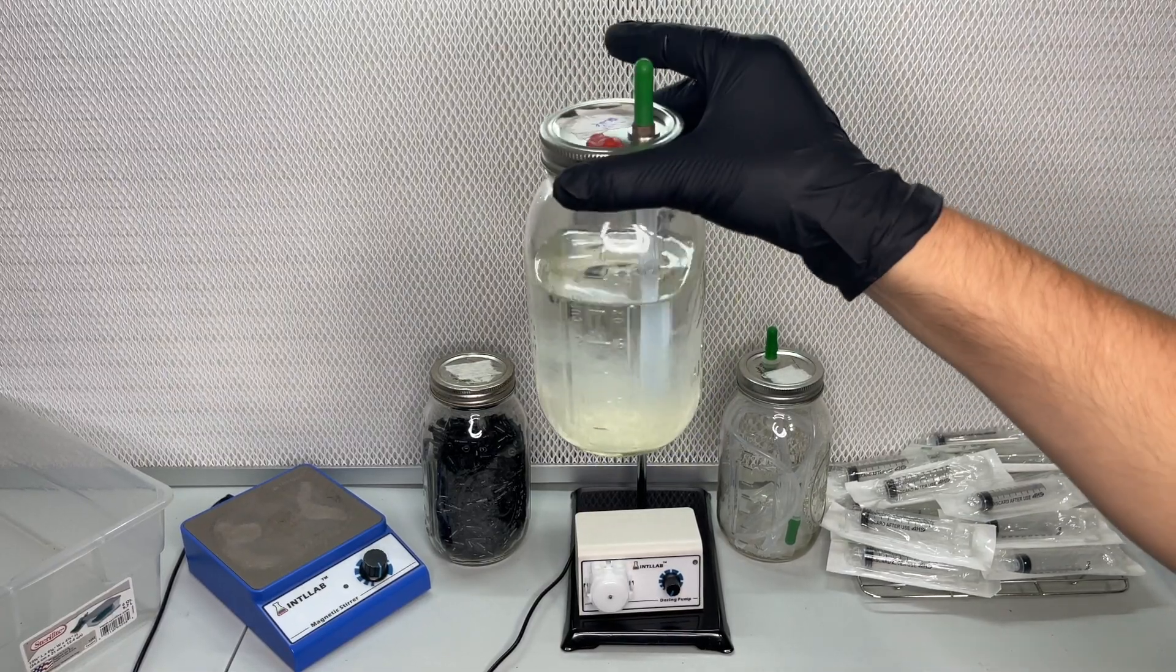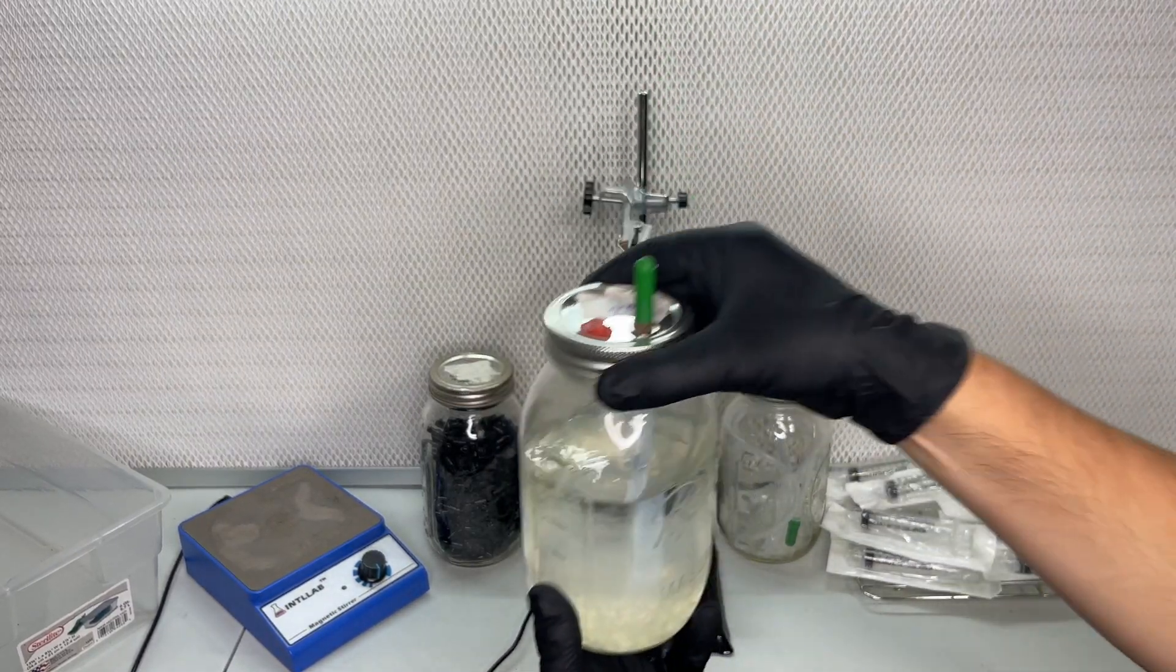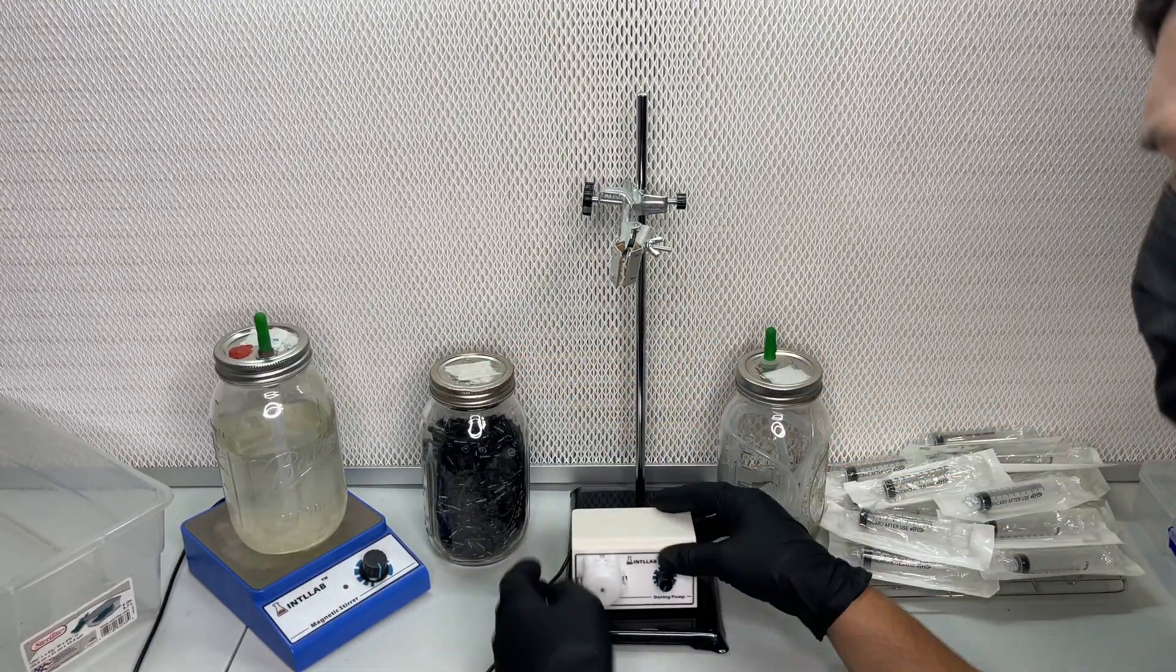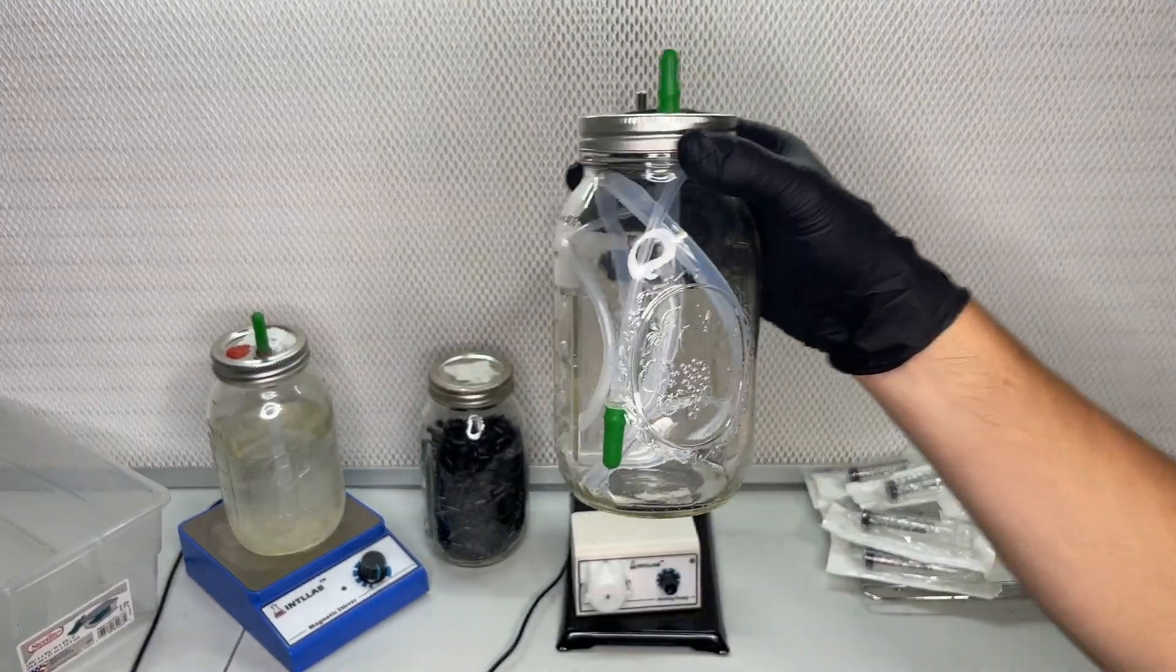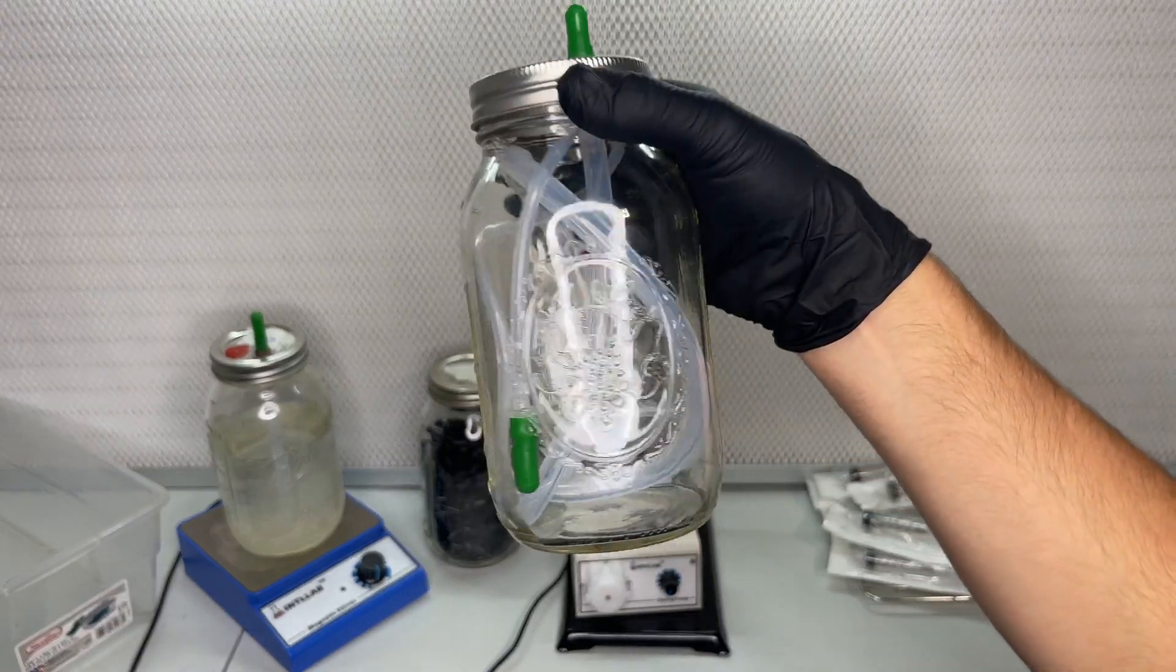This liquid culture jar has a quarter inch bulkhead adapter in the lid. It can be plastic or brass and it has a quarter inch tube reaching down to the mycelium and a rubber stopper on the top.